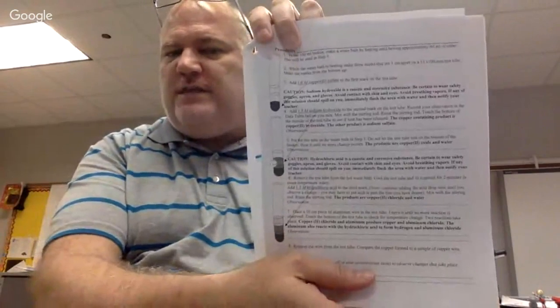In a test tube. And we're going to be doing chemical reactions. One of the cool things about chemical reactions is taking two things, putting them together, and ending up with something totally different. So let me walk you through. The two places I want you to be looking at here are page 2, which has all of the diagrams with the test tubes, and page 3, which is a data table set.